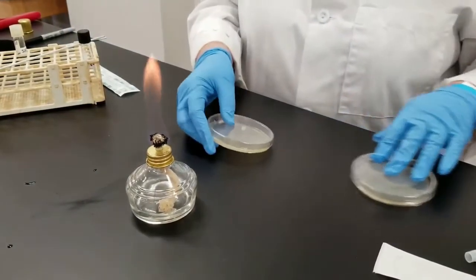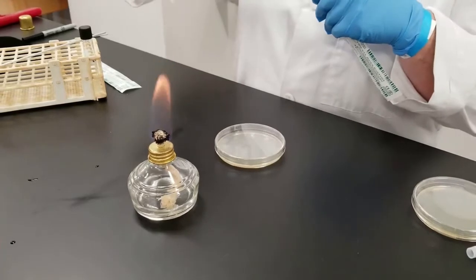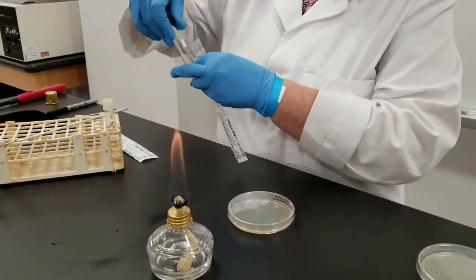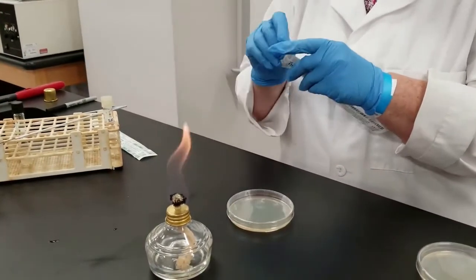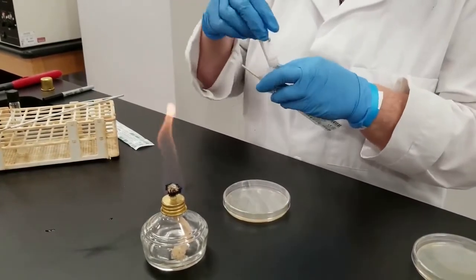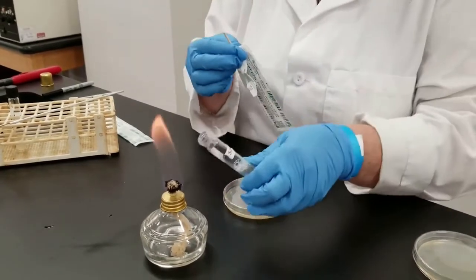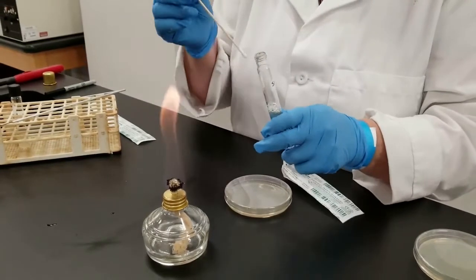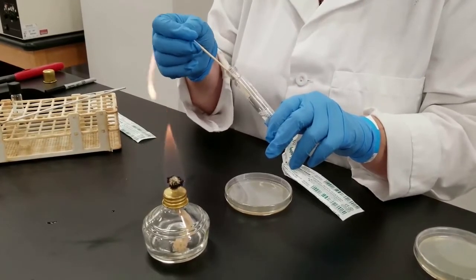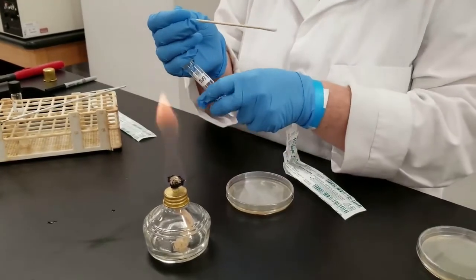And then I have the second plate. As I said, it is with Staphylococcus aureus. Oftentimes with liquid cultures, if they've been sitting for a while, it tends to precipitate kind of down at the bottom. So you want to just kind of shake the tube up a little bit. I will do the same thing with this culture as I did with the other one. Flame the tube, remove the cotton tip applicator. We're kind of pressed to get off the excess fluid. Flame tube, cap it.